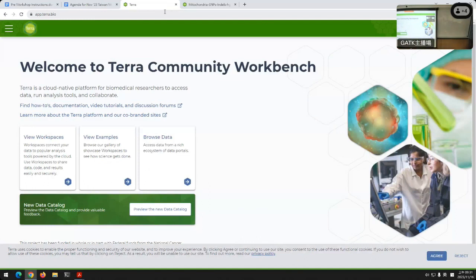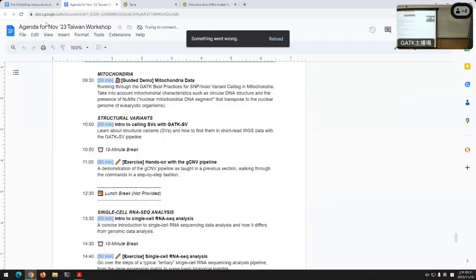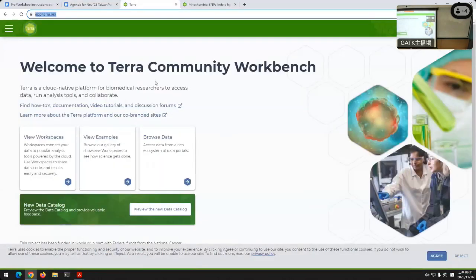Well, as mentioned, this is actually my last presentation giving you guys today. We haven't given this mitochondrial demo a few times, but I hope to teach you a few things, like where to find some of our featured workspaces on Terra and why we even have this mitochondrial demo. So you don't have to follow along with me for now, but if you do, we can just go to app.terra.bio here, right? Or I can stay on the page.